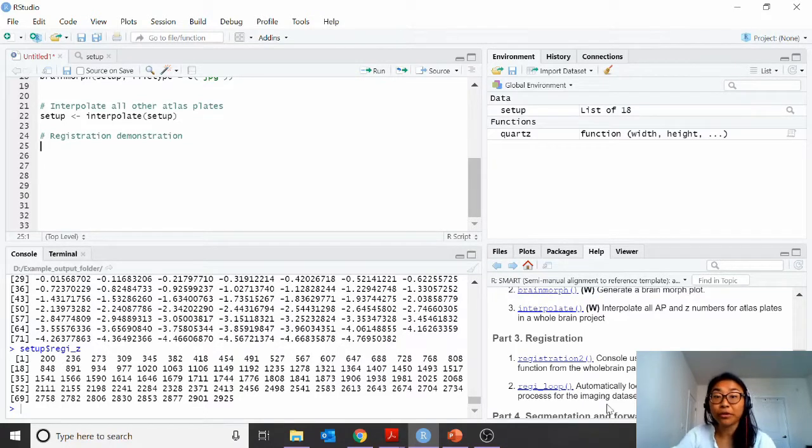Hi, welcome to the third part of the SMART tutorial. In this video, we're going to cover the registration process.